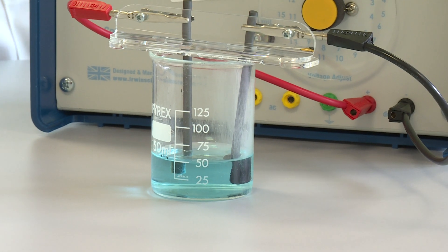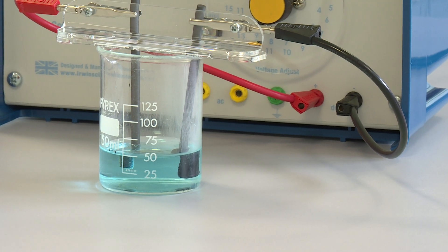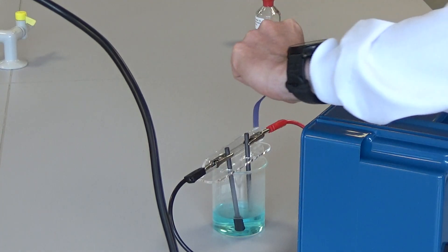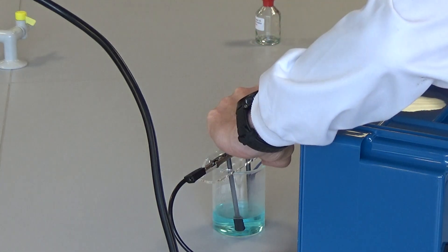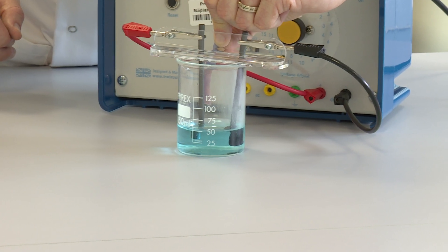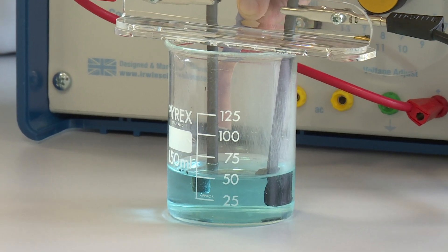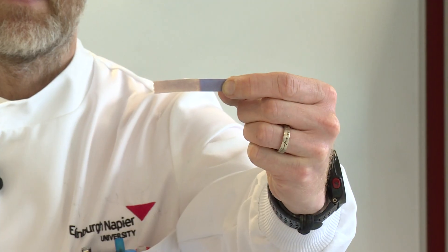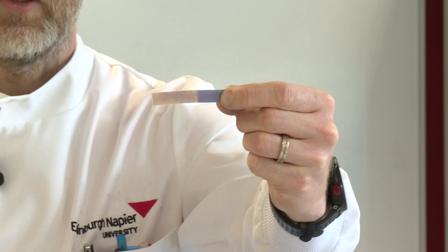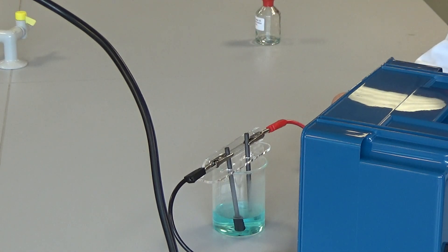We can confirm that it's chlorine gas being produced at the positive electrode using some moist blue litmus paper. Chlorine gas will bleach moist blue litmus paper. If I hold that just above the electrode, you can see already that the blue moist litmus paper has bleached, confirming that it's chlorine gas that's formed. And by gently wafting, you'll get the characteristic chlorine smell as well.